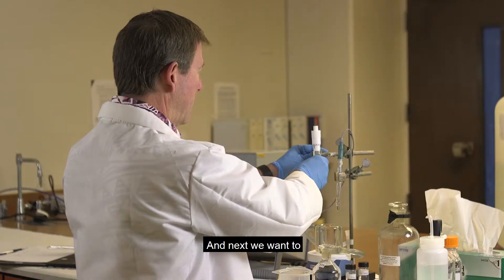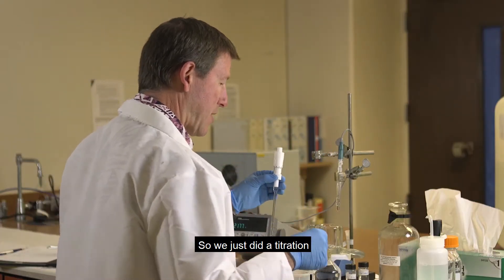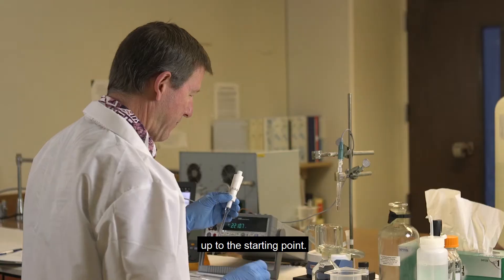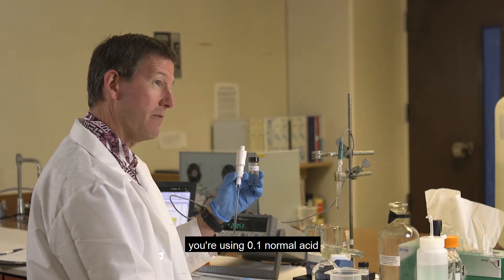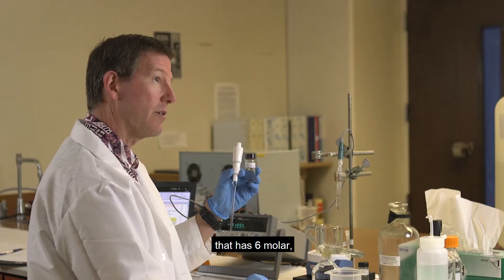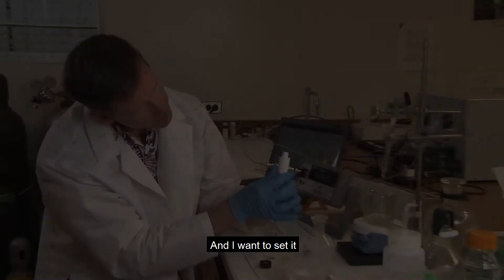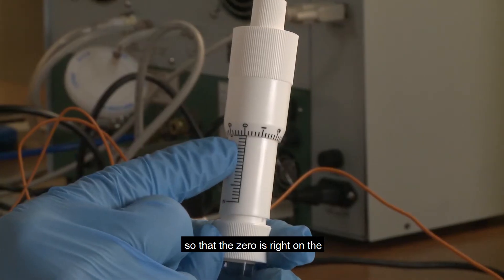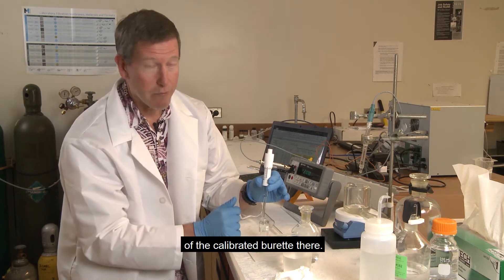And next we want to fill our burette. So we just did a titration before, so I have to refill this burette back up to the starting point. Now, you're using 0.1 normal hydrochloric acid for the titration that has 0.6 molar sodium chloride in it, and I want to set it so that the 0 is right on the vertical line of the calibrated burette there.